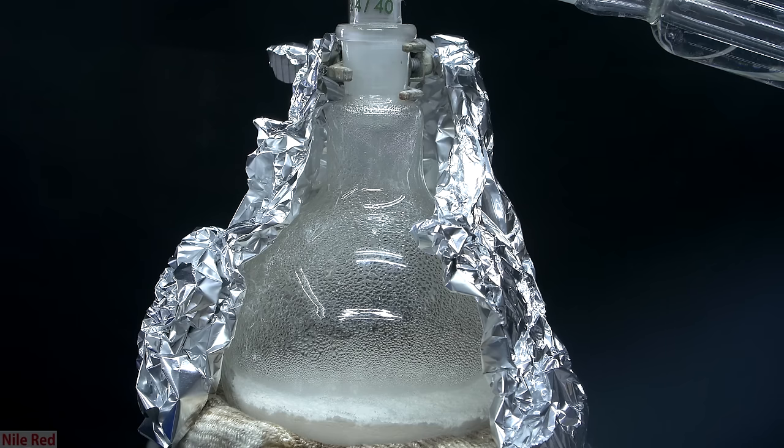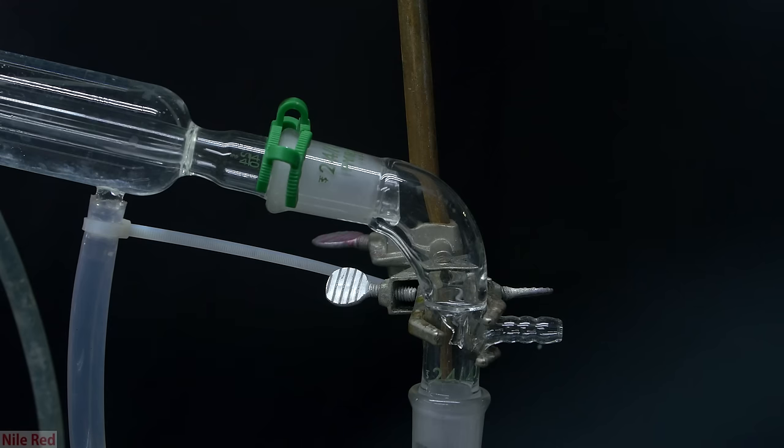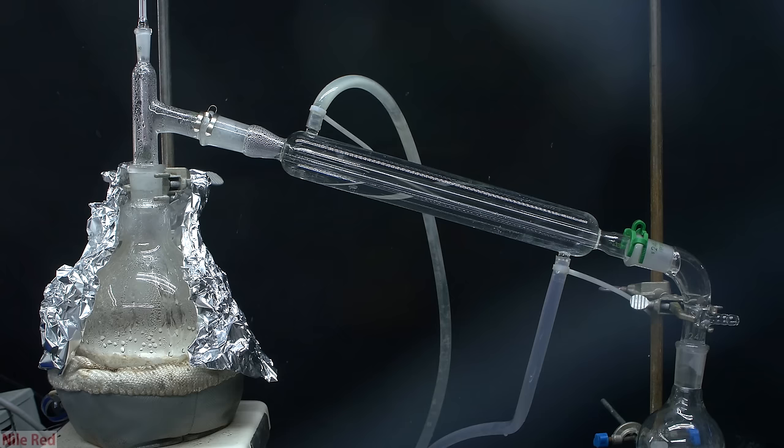To prevent heat loss and help some of the condensate make it over, I insulate the flask with a little bit of aluminum foil. As we continue heating, a distillate will start to come over, and this is going to be mostly water, but I think there is a little bit of acetone in there. The calcium acetate that I used wasn't pre-dried, so it makes sense that a little bit of water comes over first.